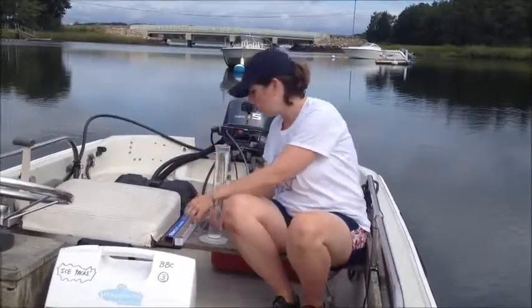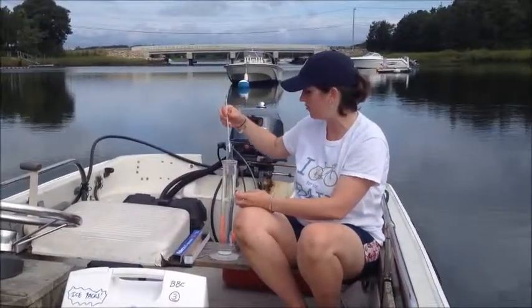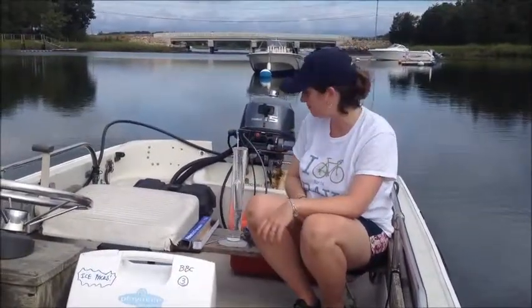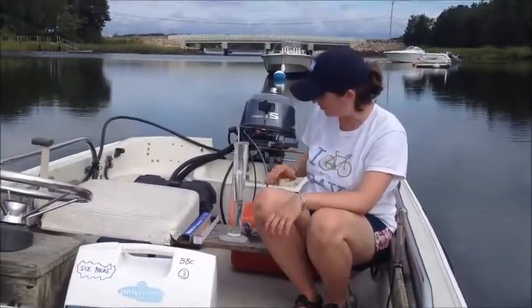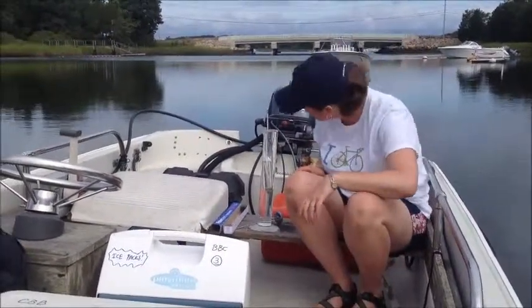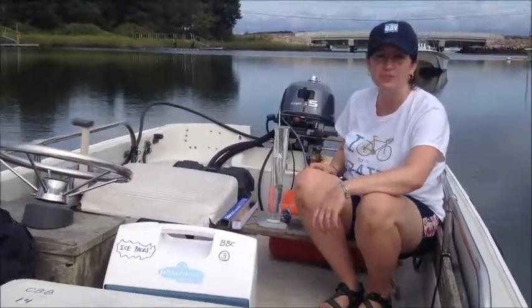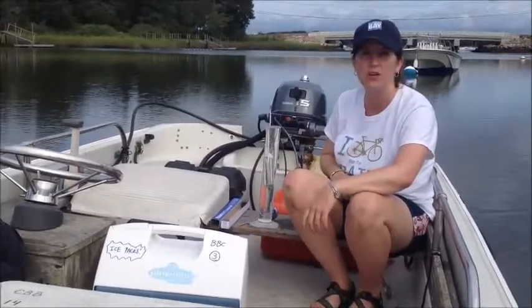After we measure temperature, we use a hydrometer, which gives us a relative measure of density that we use with the temperature in order to calculate the salinity of the water. And you can see it's bobbing up and down until it reaches neutral buoyancy, and then we read on the hydrometer, and the reading here is 1.020. And with the temperature reading and the hydrometer reading, we can calculate salinity.